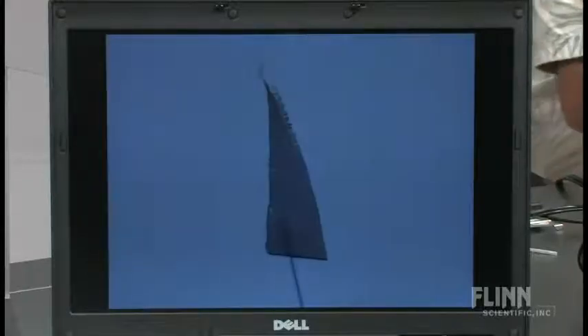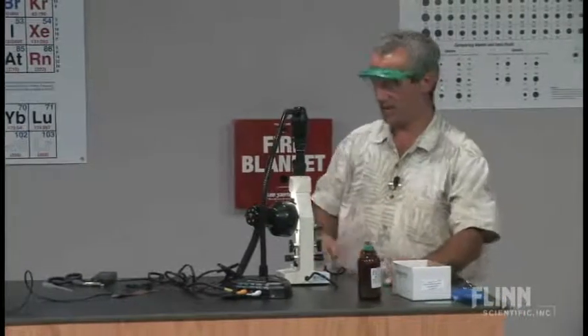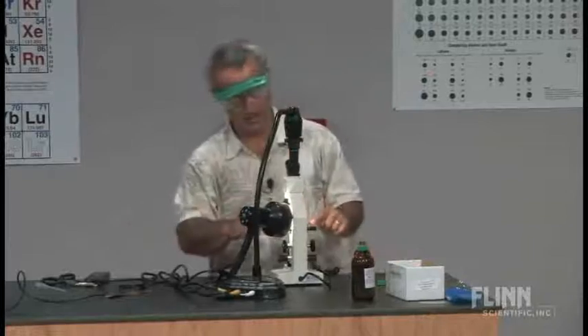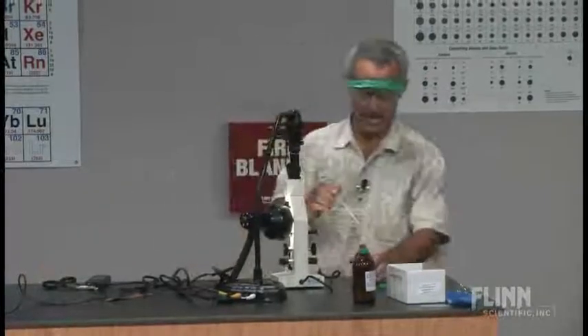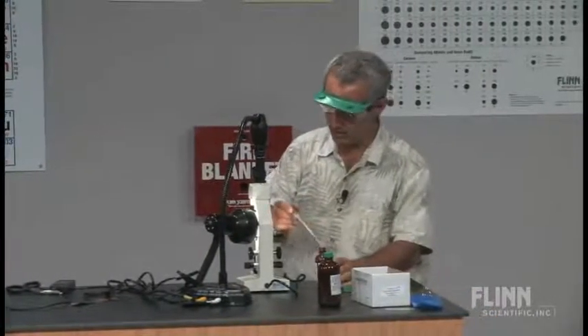This works with both backlighting and front lighting, so we'll keep that on. All I need now is just a drop of silver nitrate solution. It's on a microscope slide with a cover slip on top. I'm going to put a drop on the side and let the capillary action draw it over into the area of the copper. There it goes — and right away, what do you see happening?